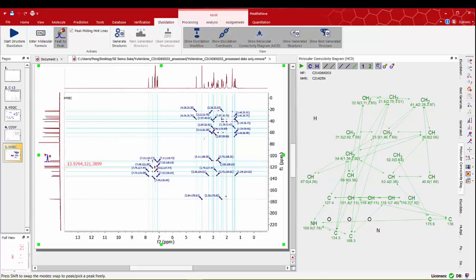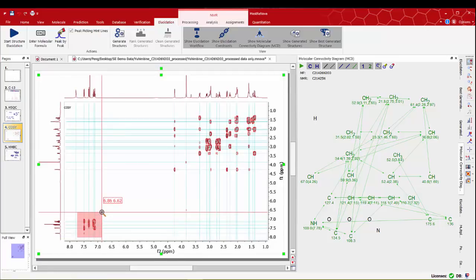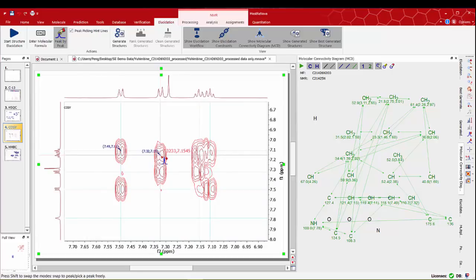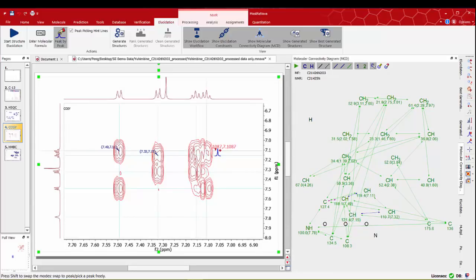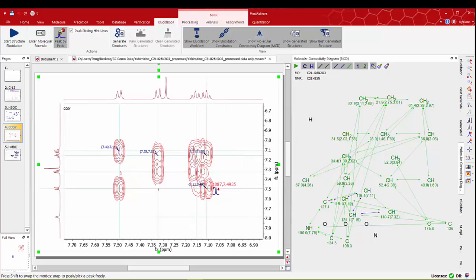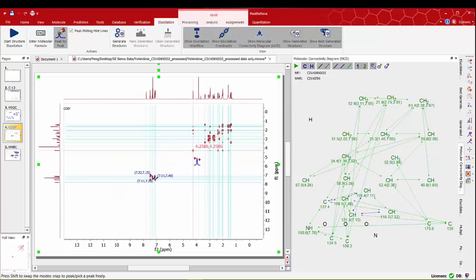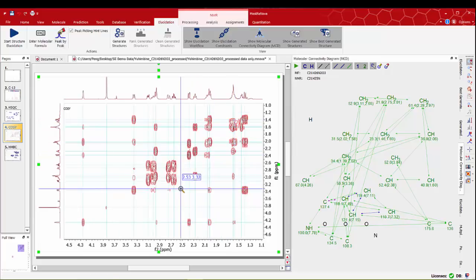We can now switch to the COSY spectra. Starting with the aromatic region we can pick some of the cross peaks. Direct connectivities are displayed as blue arrows on the MCD panel. We don't need to pick symmetrical correlations on both sides of the diagonal but it's okay if any of them are picked. Let's do the same for the other region and pick the correlations we're sure about.